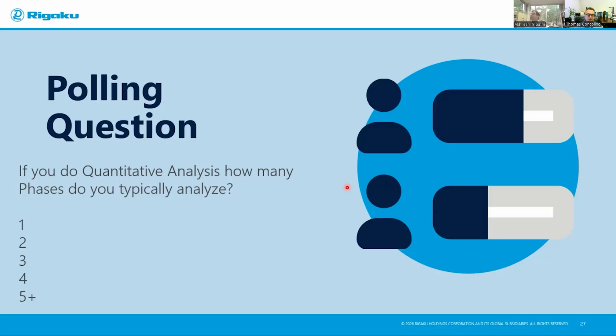So you show glass holders, obviously, in your earlier slides. The question is, aluminum holders are just fine for this as well, right? There's no reason to have any specific type of sample holder.